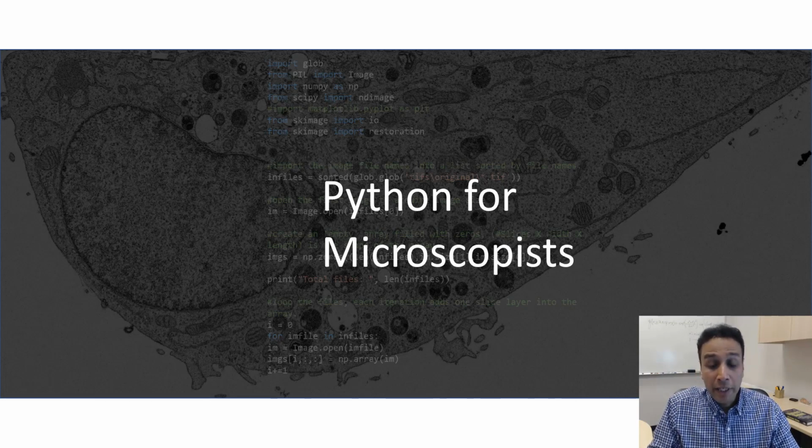These tutorials are for beginner coders who can be students, researchers, or anyone who's interested in image processing using Python. In today's tutorial, we're going to talk about Scikit-image, one of the libraries in Python that is dedicated to image processing. Let's start by looking at the basics, for example, just looking at resizing of images, and then a couple of ways of doing some image processing functions like edge detection, image deconvolution, and finally look at one of the classic use cases from microscopy, which is scratch assay or wound healing analysis.